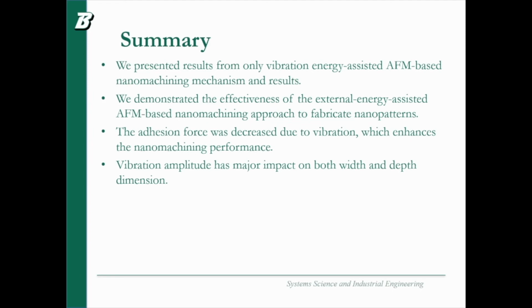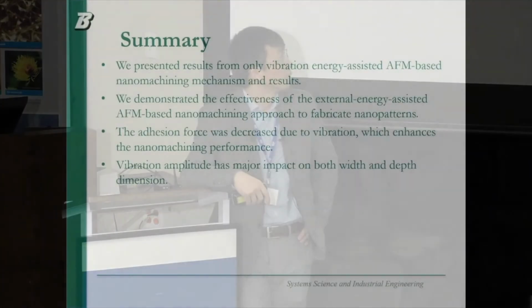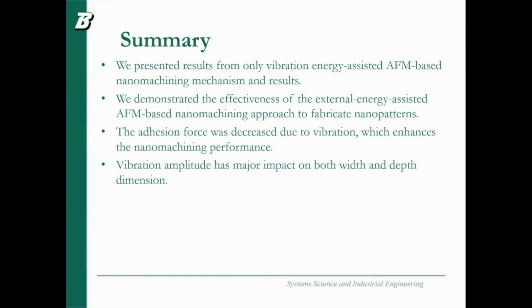So the summary is, we actually presented results using only ultrasonic vibration. It turns out the tip can work, and it works beautifully, but the tip won't last long. If we use a little bit higher temperature, just from 25 to 45, it can rapidly decrease the need for force. Originally we used hundreds of nanonewton, 300 at least, to get similar results, but now we can use 50 nanonewton. As we know, lower force is always associated with lower tip wear. Another interesting thing is the vibration amplitude has a major impact on both width and depth.